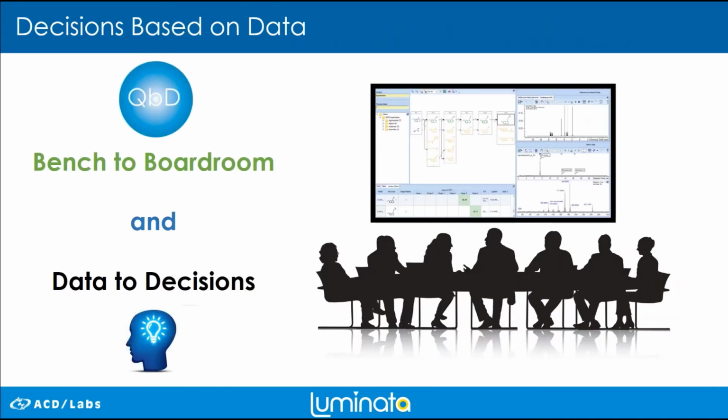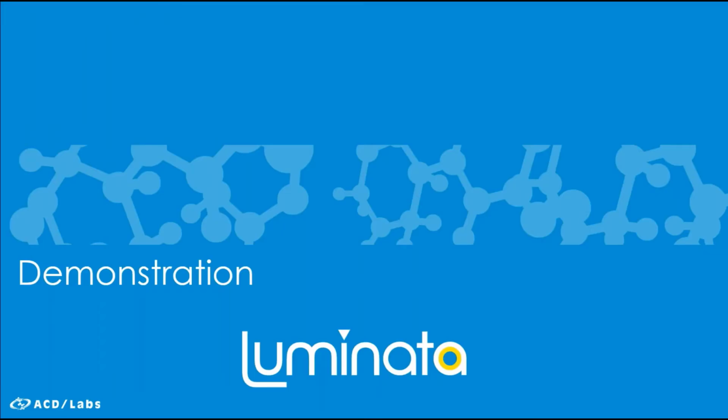So taking bench to boardroom and finally data to decision has been quite crucial and useful for all team members for a project. So at this point, I'm going to go into the demonstration.